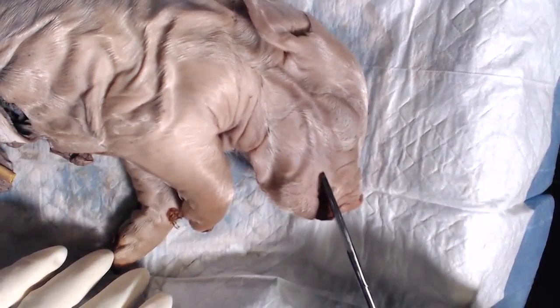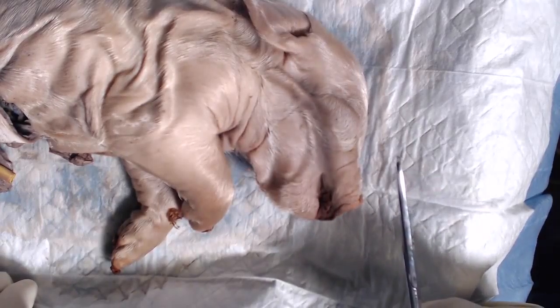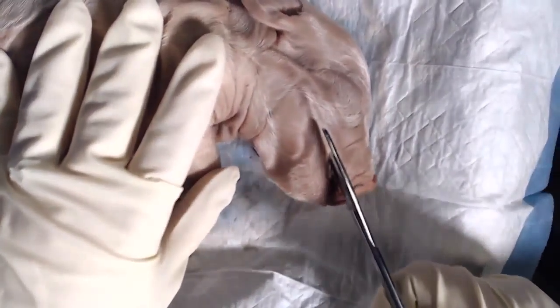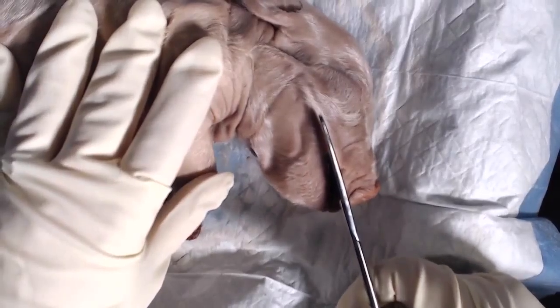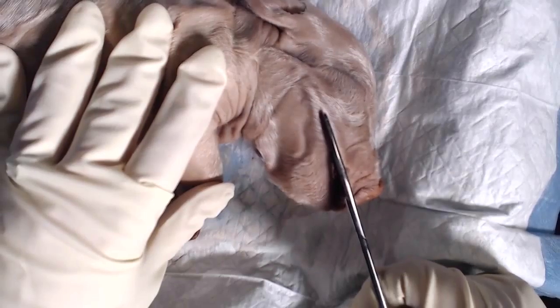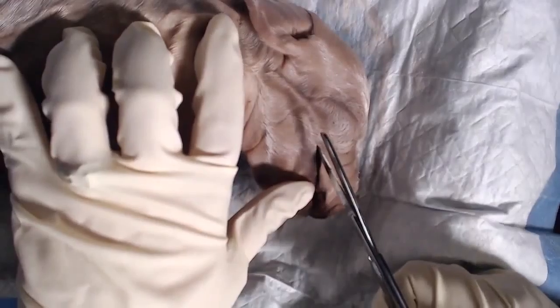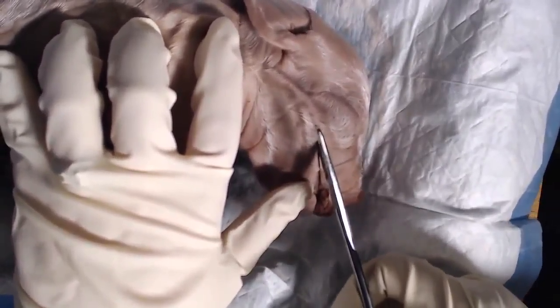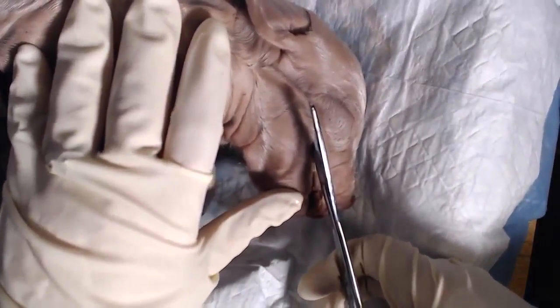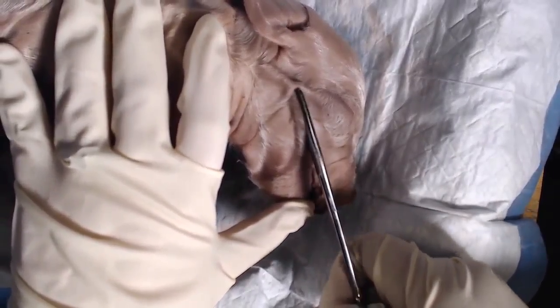You're going to want your scissors, because we're just going to make a short cut at the corner of the pig's mouth, and you want to aim it towards the pig's ear. Just make a short cut there, through the skin. Then you can dig your scissors in a little bit deeper, and you want to go just under the skin. Remember, don't get into that masseter muscle. Just keep aiming towards the ear.